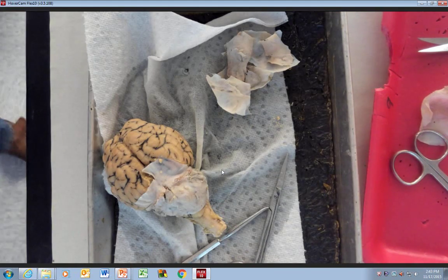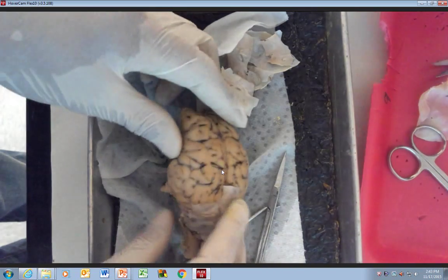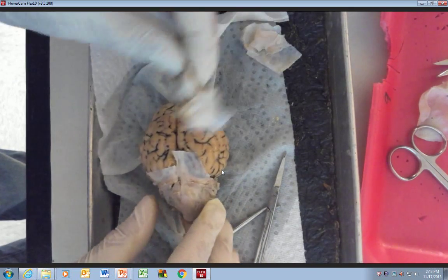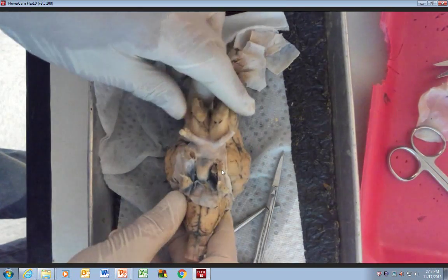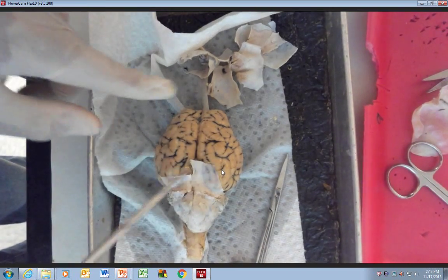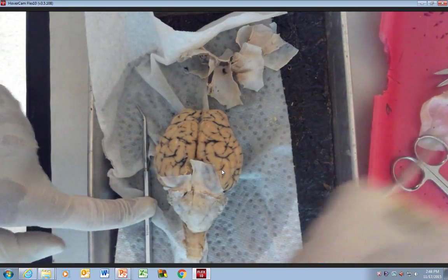Okay, so get back up here. What we are trying to see is we're going to identify all the parts of the brain. What they've done is they've removed the dura mater. So now, as you can see, the optic chiasma is visible. I'm going to point out different structures and add annotations to the video.